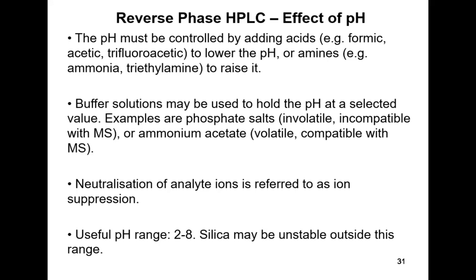And if the pH is very high or low, then protons, if it's acidic, or hydroxide ions, if it's alkaline, can also get in and start to cause hydrolysis reactions within the silica. So it can weaken the stationary phase particles and slowly start to dissolve them.